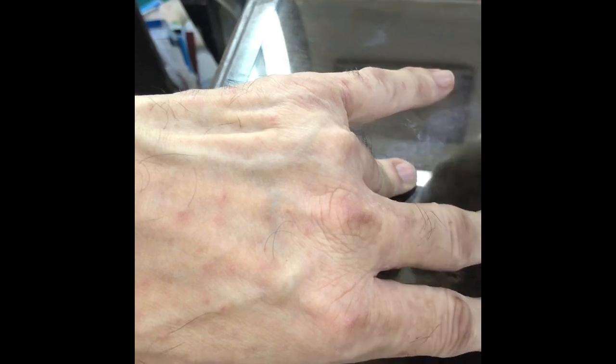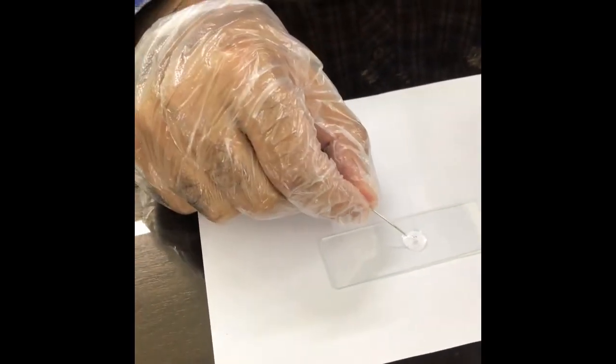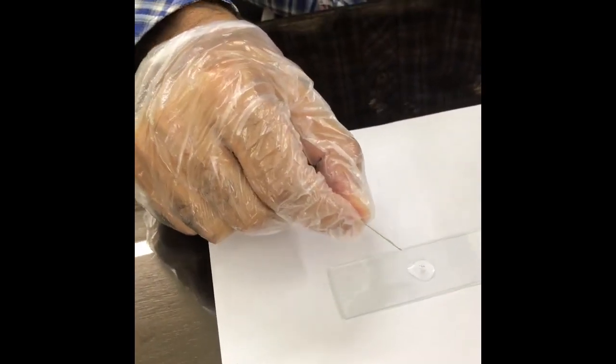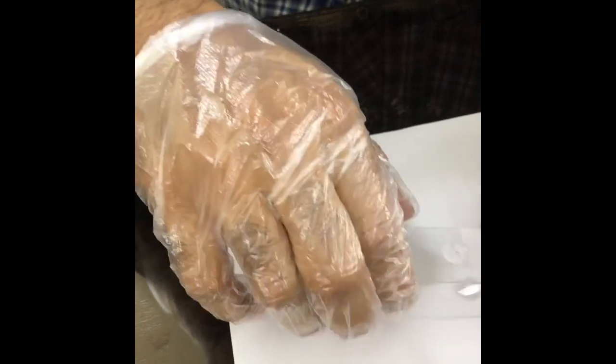Focus towards this side. This mite will come readily in this white soft paraffin — now it's roaming on this liquid paraffin. So we are just going to see it under the microscope.